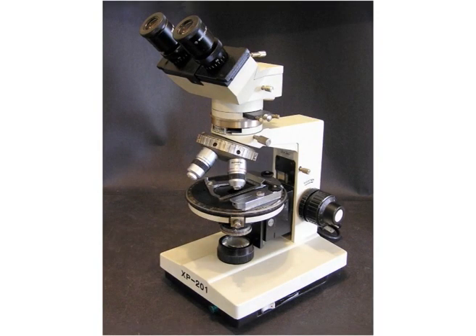A petrographic microscope is a type of optical microscope which is used in petrology and optical mineralogy to identify rocks and minerals in thin sections. The microscope is used in optical mineralogy and petrography, a branch of petrology which focuses on detailed descriptions of rocks. The method is called polarized light microscopy.